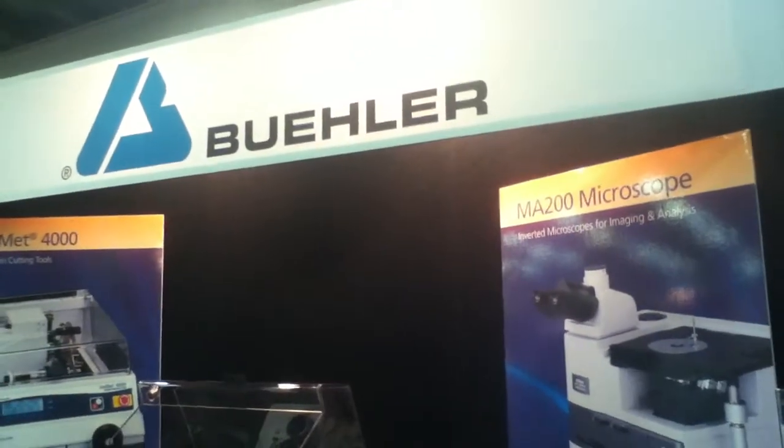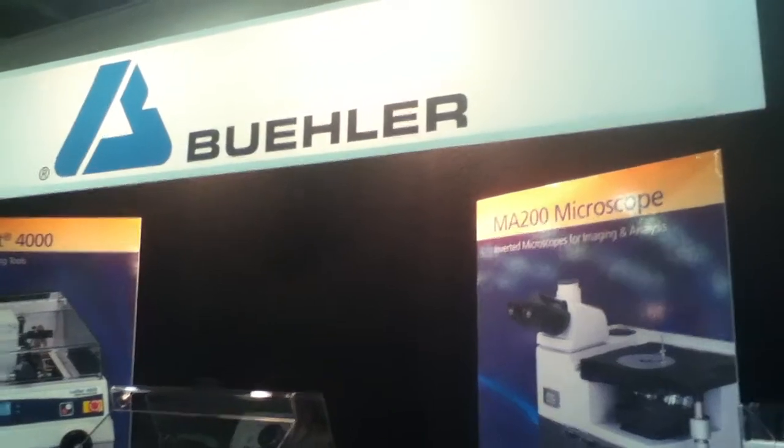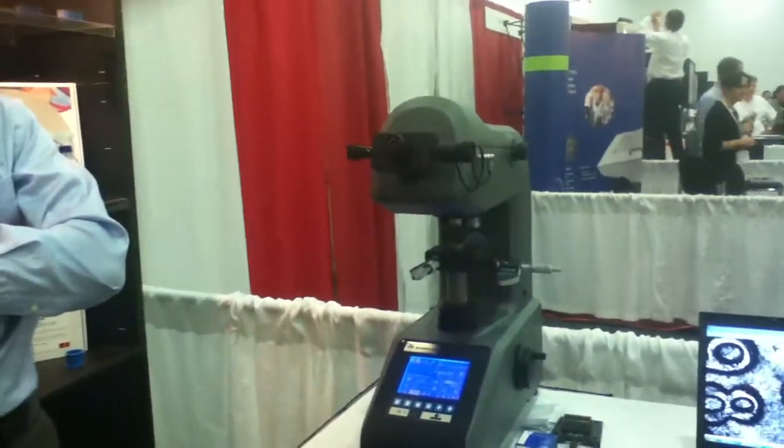Hello everyone, I'm Julie Calista reporting live from MS&T here in Columbus, Ohio. We're here at the Buehler booth and we have Sean O'Flattery here with us, and he's going to talk about the new Micromet 6000 hardness tester. Sean, why don't you tell us a little bit about this hardness tester?